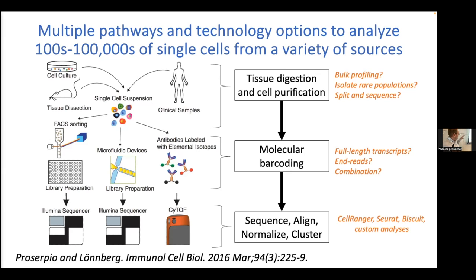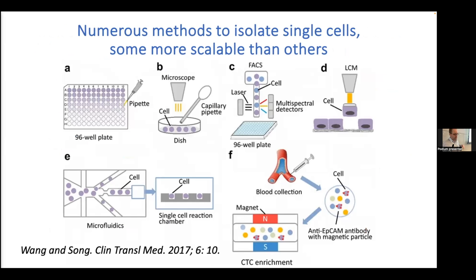And then there's a huge number of bioinformatics platforms. So I had that lineage, state and trajectory. You have to think carefully and understand those specific algorithms, and you'll get some experience with those this week. Think about why you're choosing a specific algorithm or another. Or if you're not sure, have a benchmarking plan to have two algorithms or four algorithms potentially combined or compared against one another. But that has to be a conscious part of your analytic design strategy. And this paper here really goes through all these three steps in great detail.